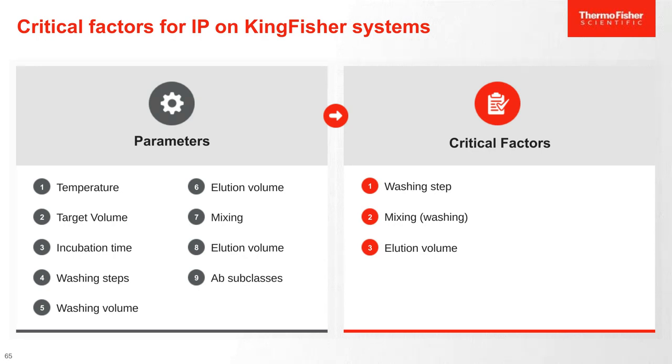So in terms of the performance here on the immunoprecipitation, the automated protocol is at least as good as the manual protocol. But also the benefit here is that you can actually just push the button and walk away and do something more scientifically interesting than pipetting.